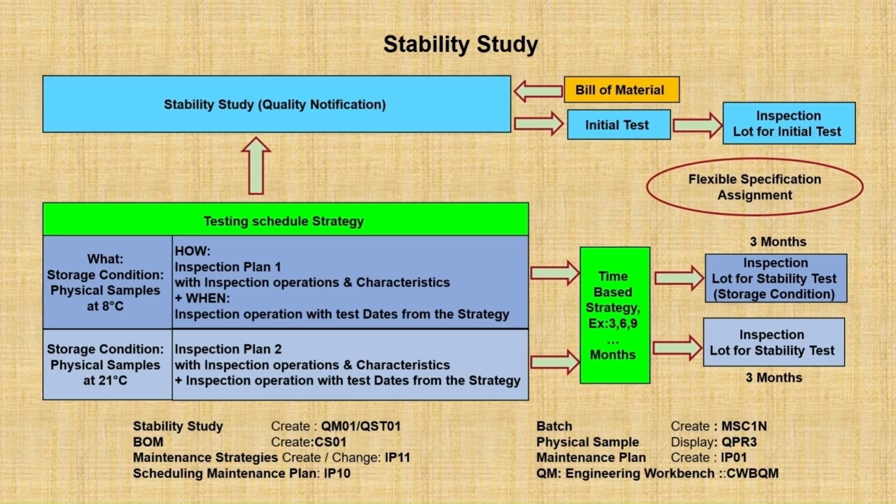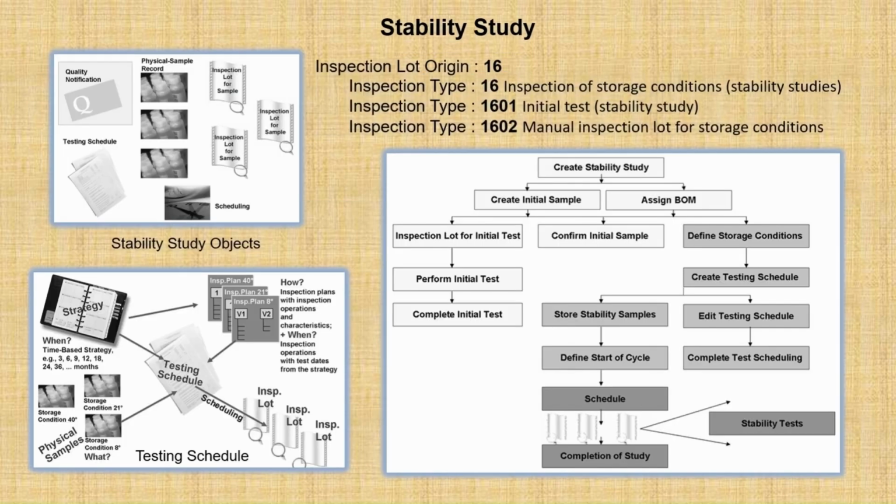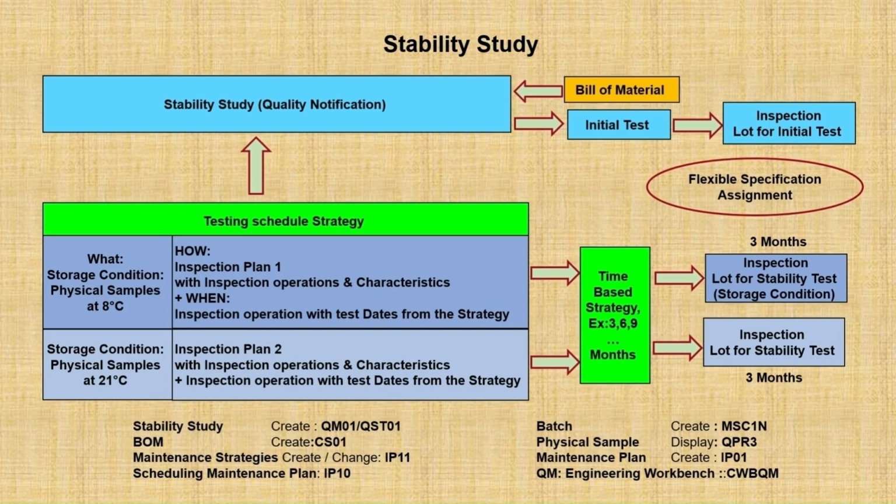And even the duration: till 1 month how was my product, and after 6 months, was the result okay or not okay? The testing schedule, you will be creating this. The temperature at which you are maintaining it, the plans which you will be creating, and what all MICs you want to test. In the stability study, we specify one total period.